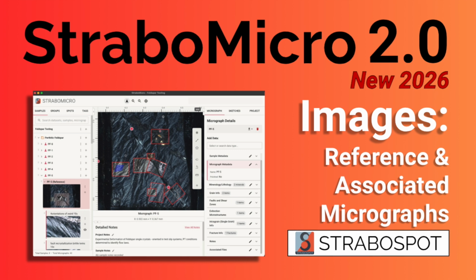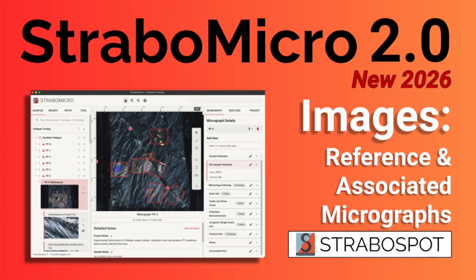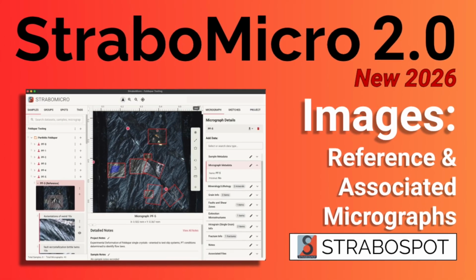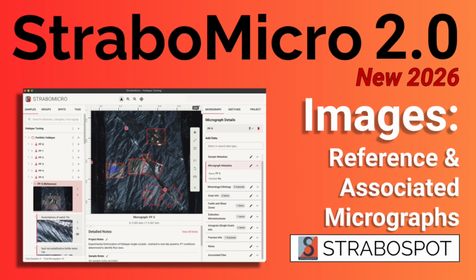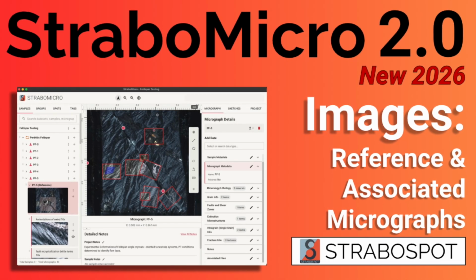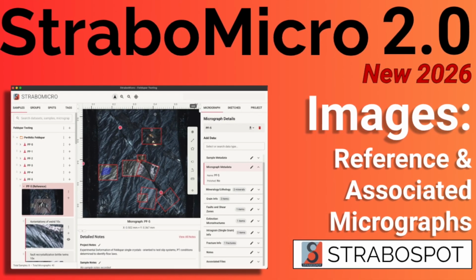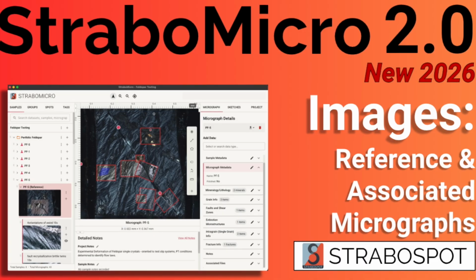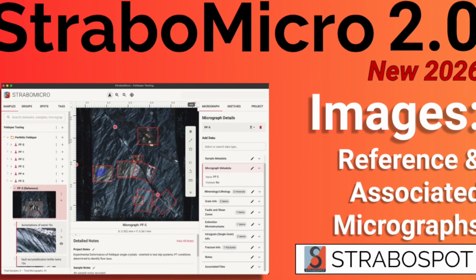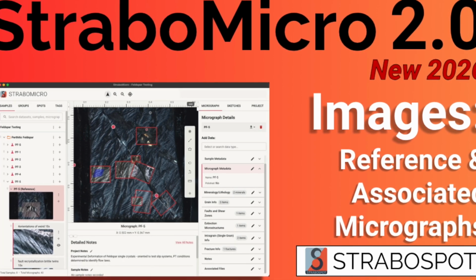That wraps up today's tutorial on micrographs in StraboMicro. A quick recap of everything we've covered. We did a review of what a reference micrograph is versus an associated micrograph, ways to upload a single micrograph or batch import micrographs, and that's available for both reference and associated micrographs. And then we walked through the 3 different ways that you can locate and orient an associated micrograph with 3-point registration, locate on a spot, or locate with a scaled rectangle.